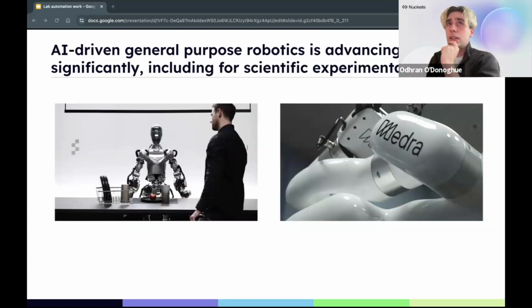Finally, you've probably seen very recently all these little things going on with general purpose robotics. We've seen many tech demos from different companies showing what these things can do. Of course, this stuff's still on the cusp of what's possible right now, but this can be used for biology as well. There are companies like Medra, which are very interested in this idea of using general purpose robotics to run scientific experiments. And where they really help with is in integrating different bits of the kit. They may not be able to do everything, but they can help a lot with wider coverage of automation.